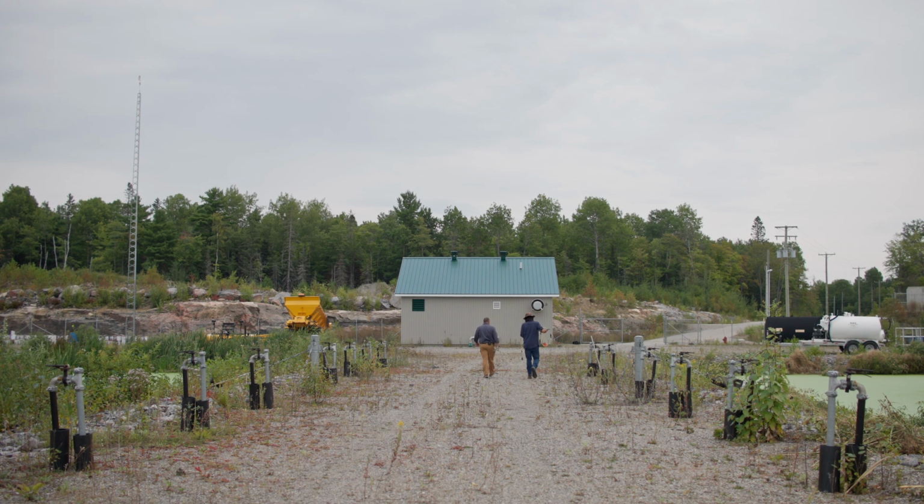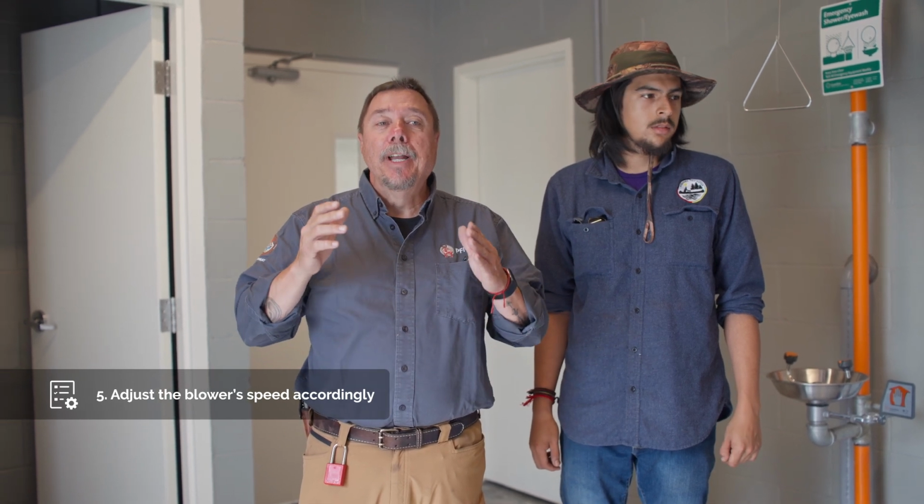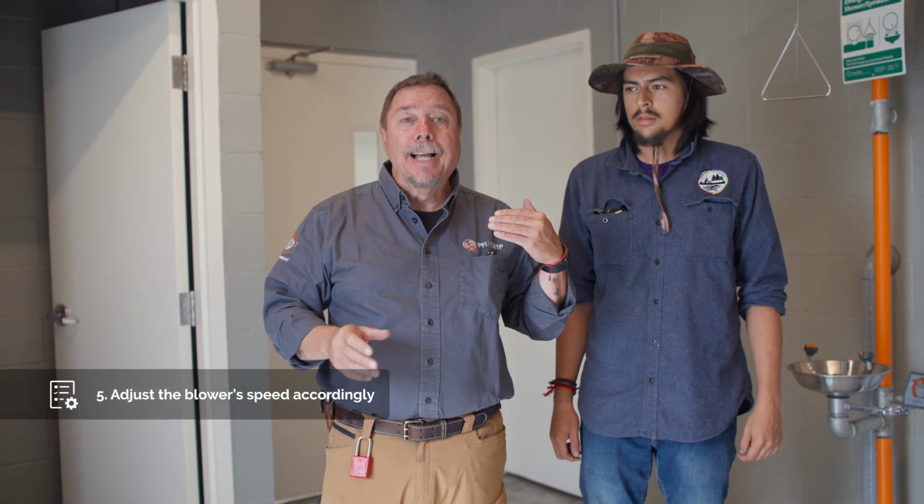Okay, so we've taken our dissolved oxygen. We were okay at the effluent, but we weren't okay at the exit of lagoon number 2, because we had 1.24 when we know that we have to be a minimum of 2. So right now we're going to go on the other side. It's going to make a little bit of noise, and we're going to adjust the blower. Right now we're set at 45 hertz, when 100% will be 60 hertz. So we'll put the blower up to 60 hertz. Tomorrow we'll come back and do another reading. If we still see that we're below 2, then we'll have to start a second blower. But we'll go up and put this blower at least at 100%.